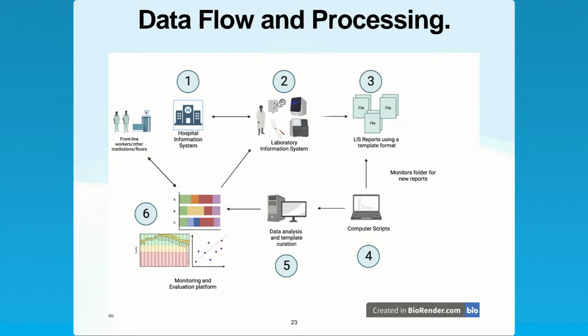And that does not require a laboratory information system or a hospital information system. It just requires a bunch of Excel sheets and CSV files. So let's start there. We created a folder and said, okay, all the files have got to live here. Initially, we wrote computer scripts that would communicate with number 2 and bring the files to number 3. If your file is already in number 3, you don't need to bring it anywhere.